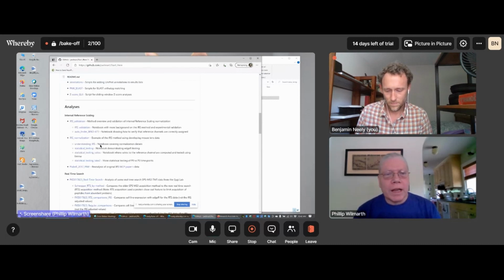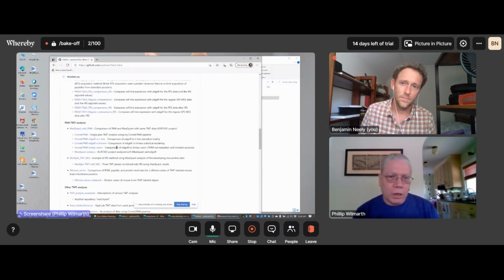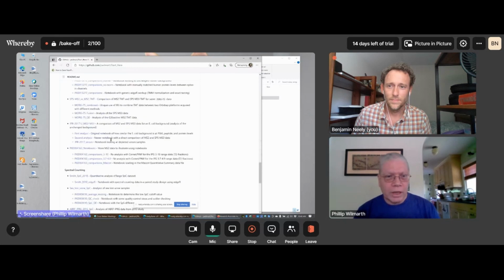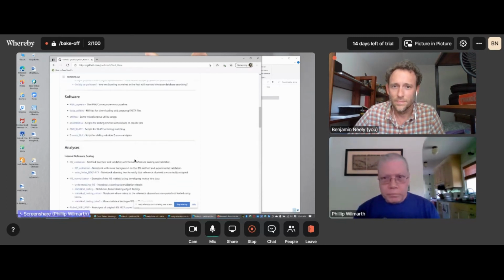And then I've also got a bunch of data analysis of public data I've pulled down using Jupyter notebooks that showcase quantitative proteomics and statistical comparisons in a visualization-rich way that's also reproducible and makes nice supplemental files that you can put into data archives. So lots of examples there, and they're all described and detailed. And then there's some meeting content, talks, and things I've given that I've turned into content on the site. So that's all available.